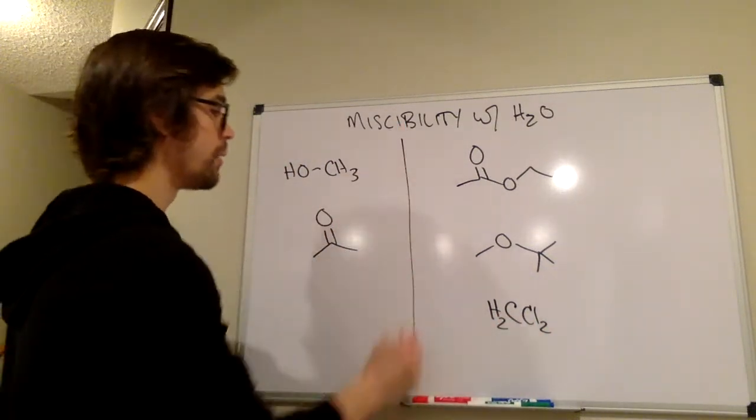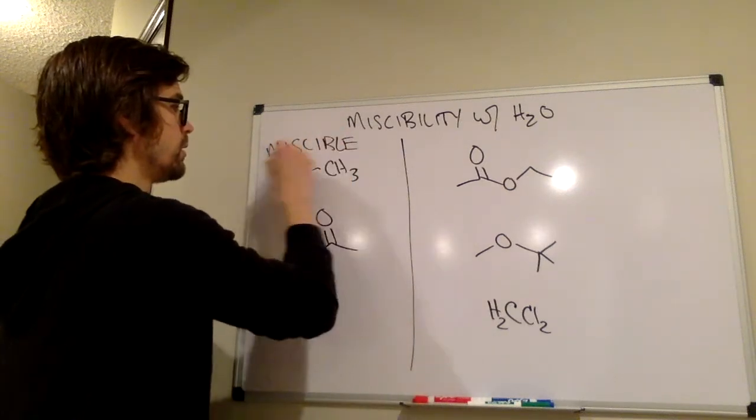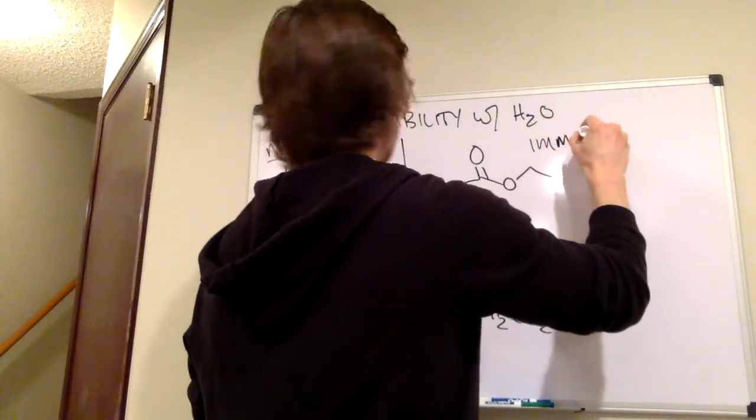And we saw that we had miscible molecules over here and immiscible. Immiscible, is that, yeah, that's a word, immiscible over here.